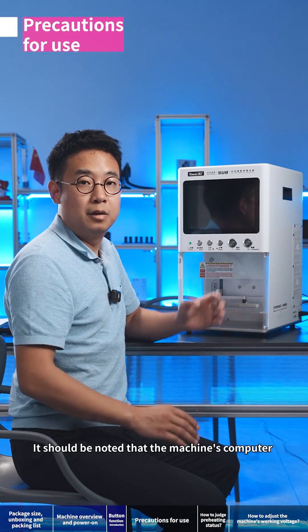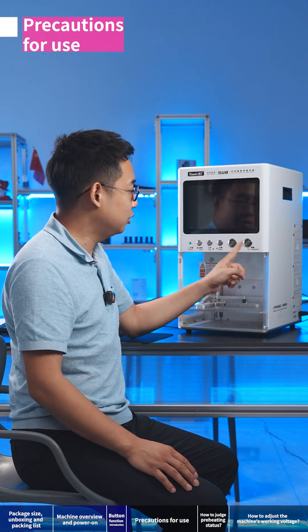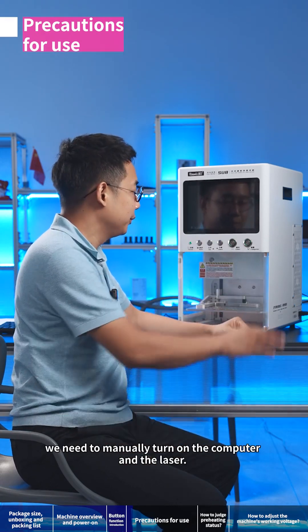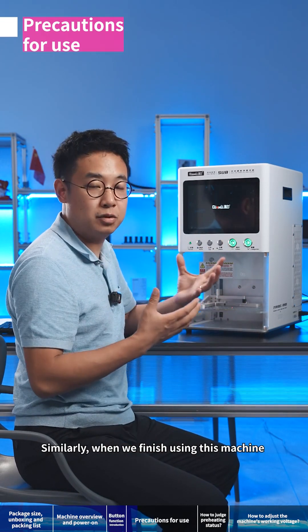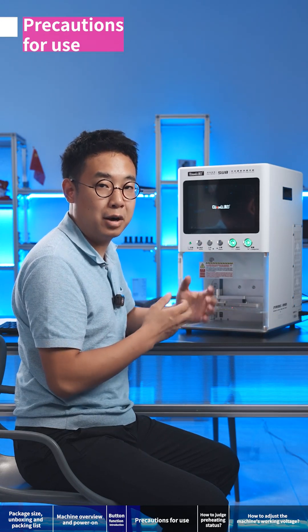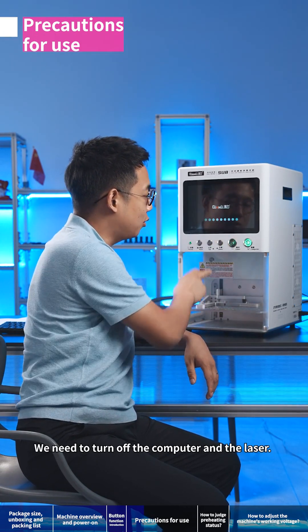It should be noted that the machine's computer and laser are controlled by independent buttons. Each time we power the machine, we need to manually turn on both the computer and the laser. Similarly, when we finish using this machine, we must also turn them both off — first the computer, then the laser.